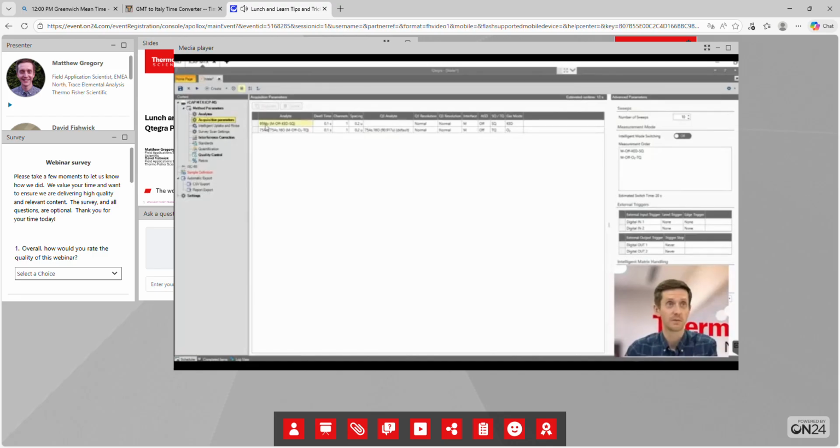So for the molybdenum, it's automatically put that in KED mode. But again, we do have the option, the flexibility to change that should we wish. So let's say we want to put everything in the same mode. So we also want to run this in triple quadrupole mode and oxygen mode. Now this is not the default, so the software hasn't proposed this for us, but again it does give us some idea whether we want to measure it en masse or by mass shift.